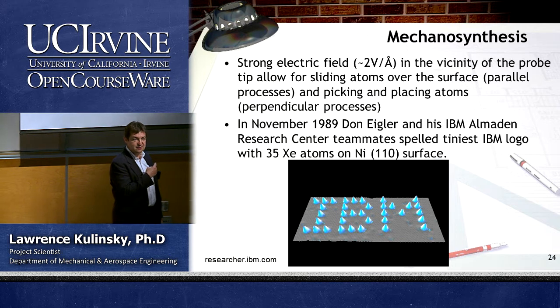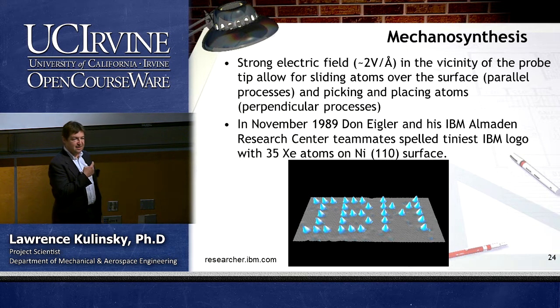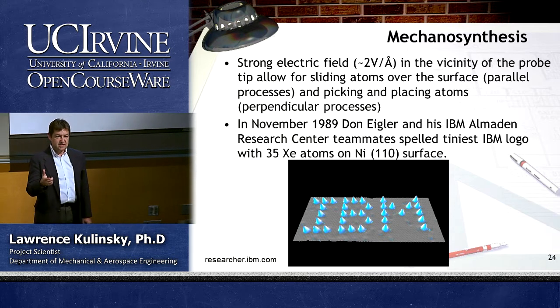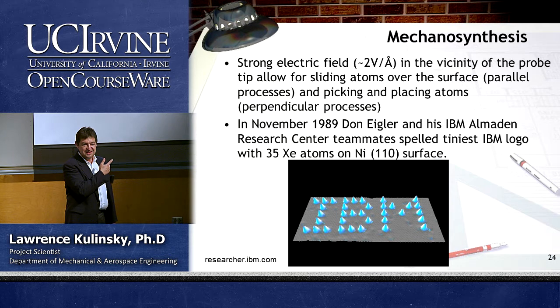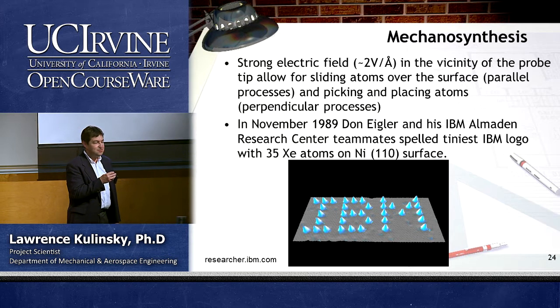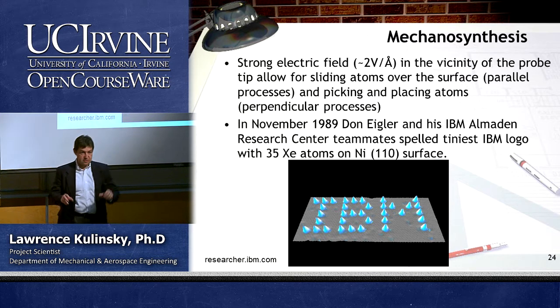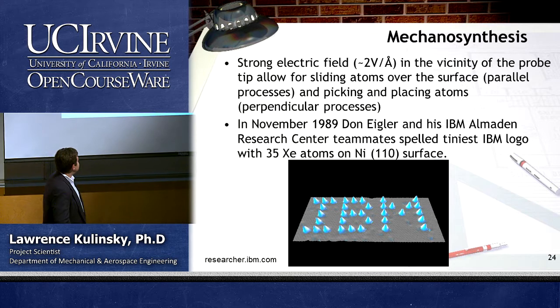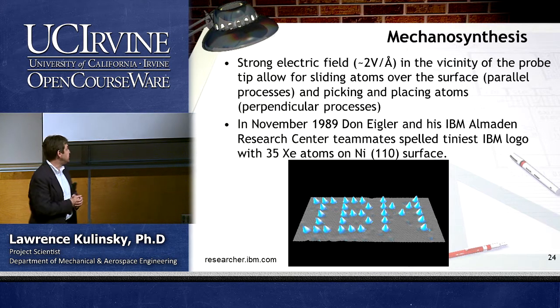When I was a student, I came to the United States in 1990, and I saw that, and I said, well, this is incredible. How can they do that? I still did not know for a long time how they did that. So I will tell you today how they do it. They did it with STM, okay? And I will tell you exactly how.